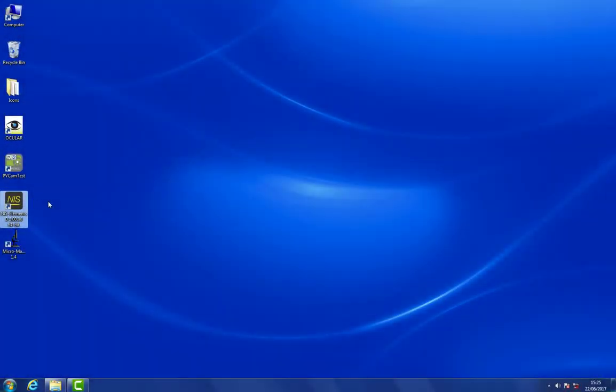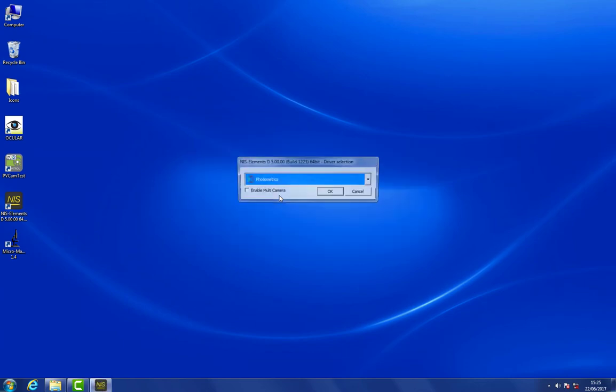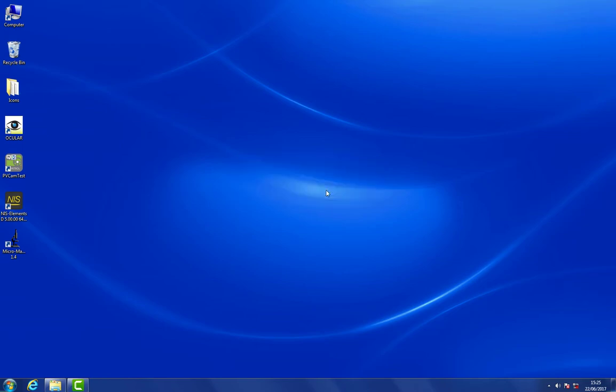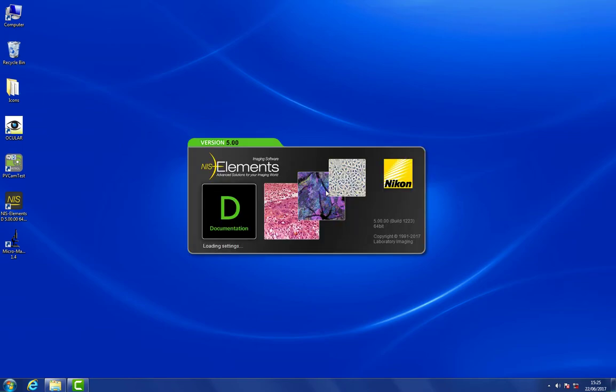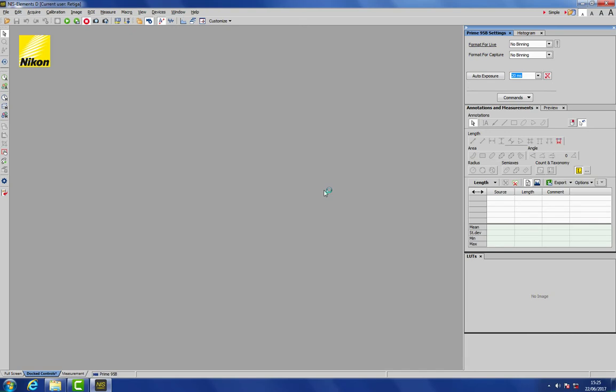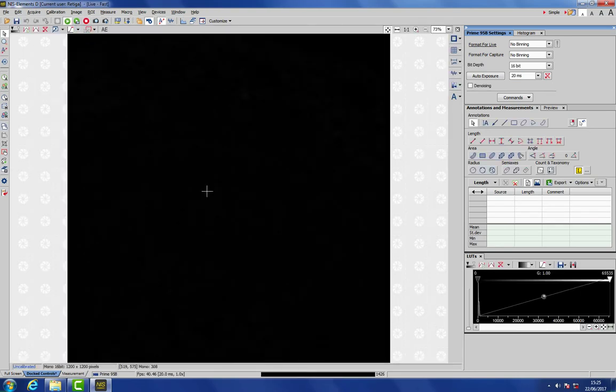So now we can run Elements. And we're using Photometrics drivers. And here we are inside Elements. The first thing we can do is press the Live View button. But with this light level we don't actually have any image, because there's no scaling applied to the image.